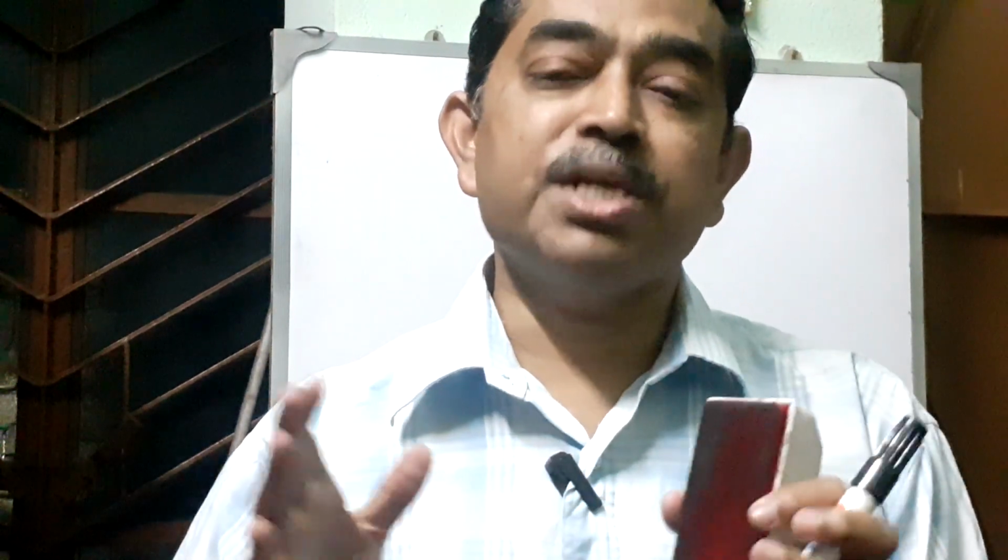Good day to everybody. Today I am going to discuss the topic plaque assay. Plaque assay means how to measure any bacteriophage or virus concentration in a sample. This is the main topic of discussion today.